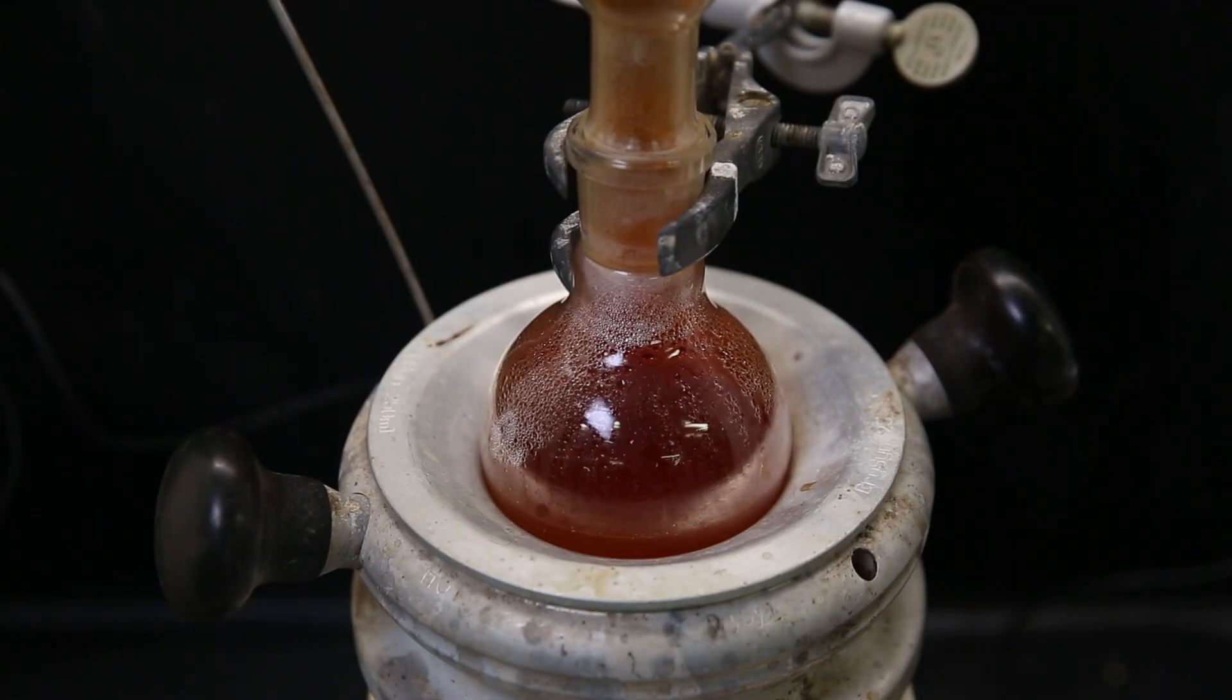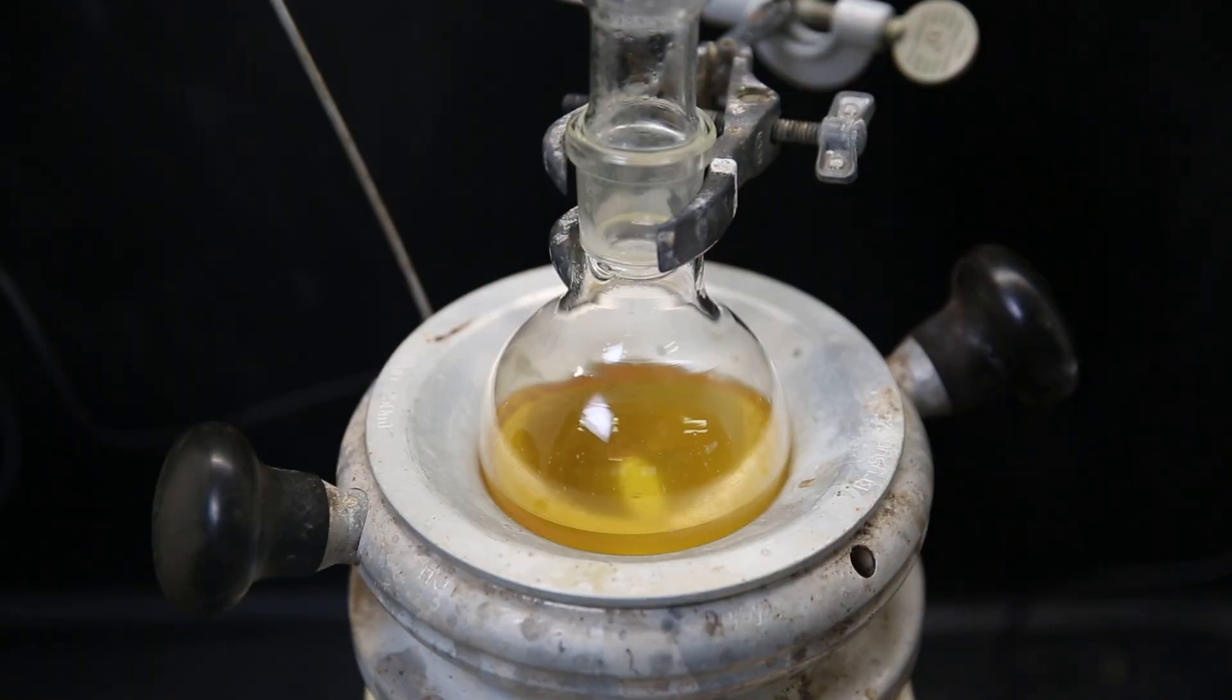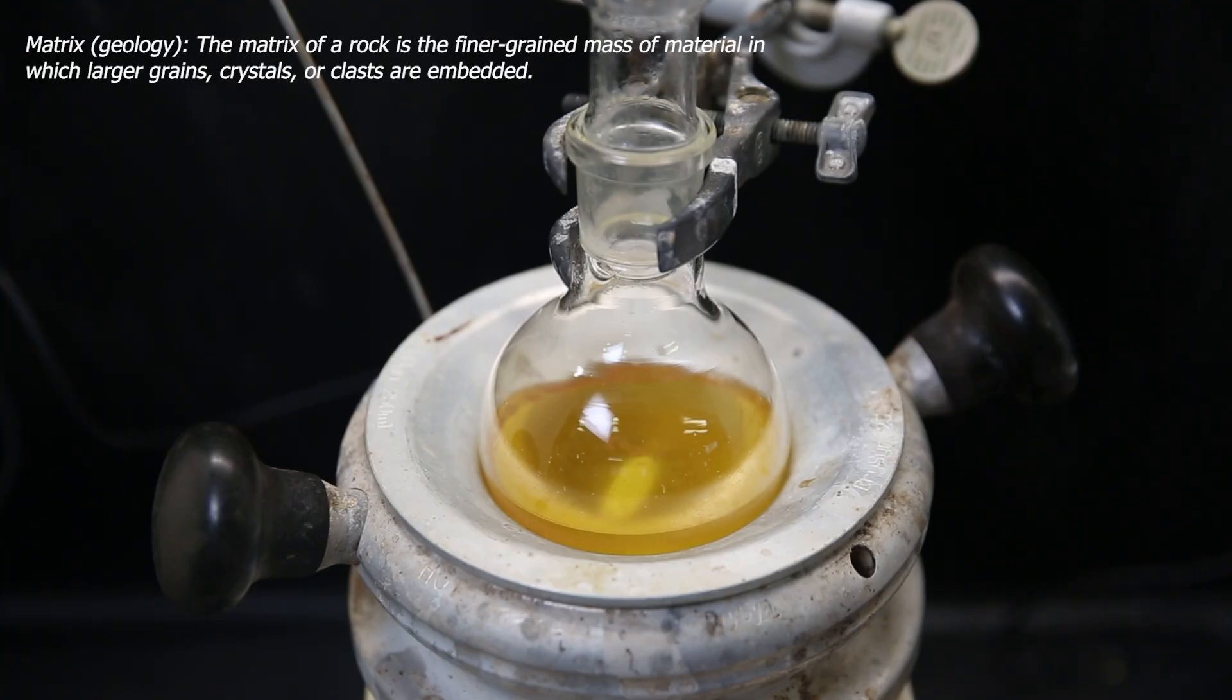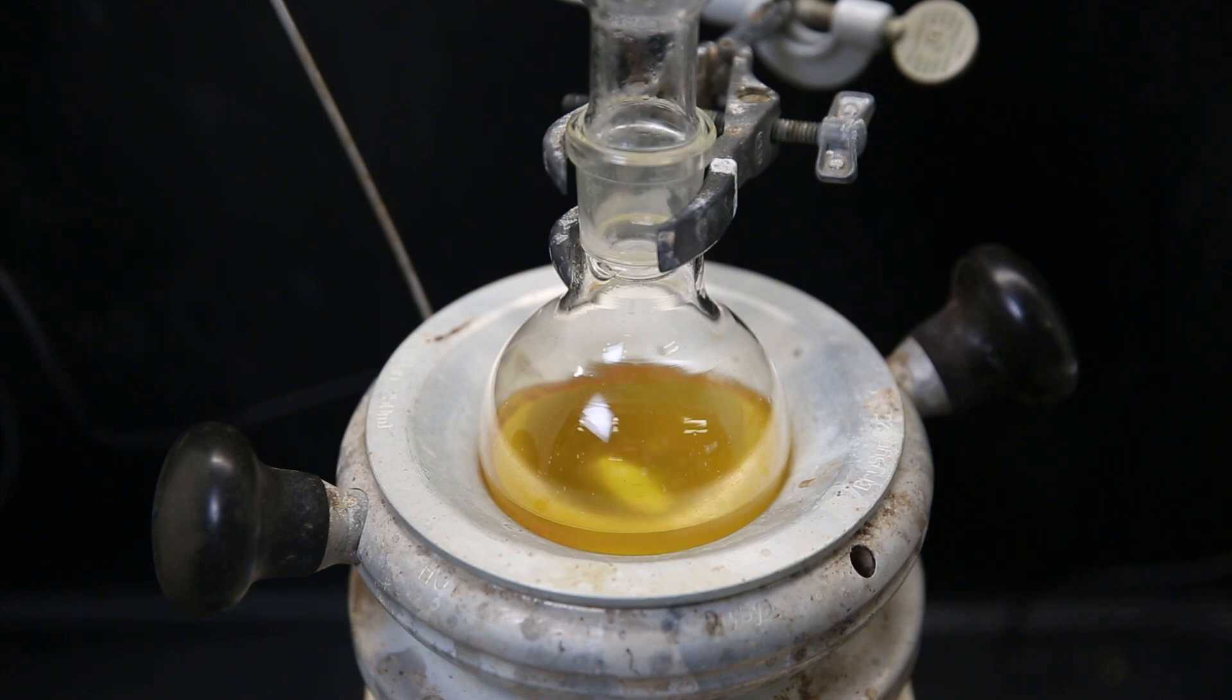I leave it to reflux overnight and when I come back the reaction is finished. And the rock has disappeared. No more gas is evolving from the mixture and it seems it has all reacted to form soluble yellow uranyl nitrate. There are still some solid bits present in the mixture which are probably just common silicate minerals from the rock matrix which didn't react with the nitric acid. Since I don't want them in there, I will have to remove them. So I remove the flask from heat and let it cool down slightly.